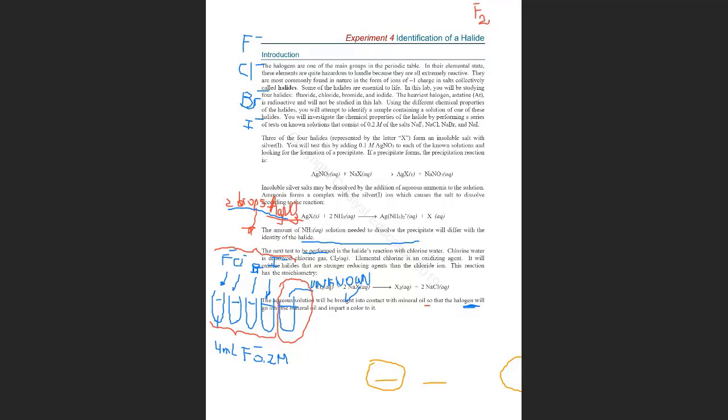What kind of reaction is that? Again, you will have 5 tubes. 1, 2, 3, 4, 5. Again, one is your unknown and the others are with each of the halides: fluoride, chloride, bromide, and iodide.